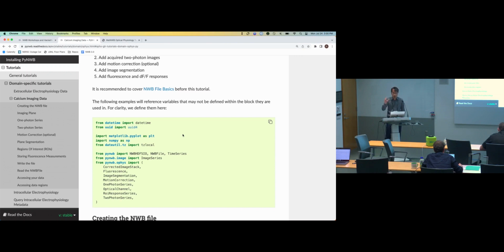You could create it in one file and link to it from all the other ones, but that means that in order to read that data, the file that has the mapping must exist while you're reading the other files. For a mapping that's relatively small, I just recommend to put it in every file. But Cody, Ben, if you have any ideas on multi-session registration.